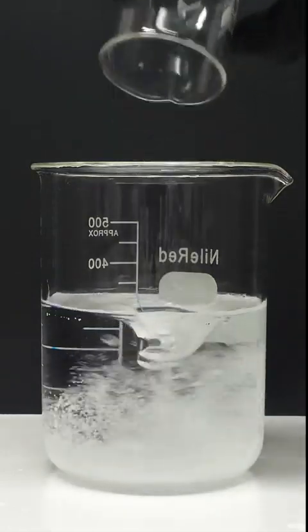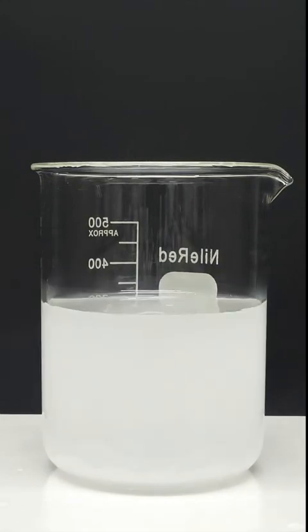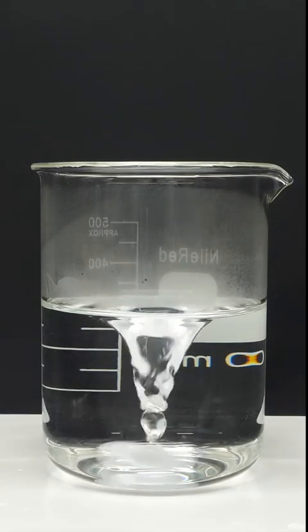Now I can dump in some sodium hydroxide drain cleaner, and I have to wait for it all to dissolve. When I didn't see any left, I turned on the hot plate, and I waited for it to heat up.